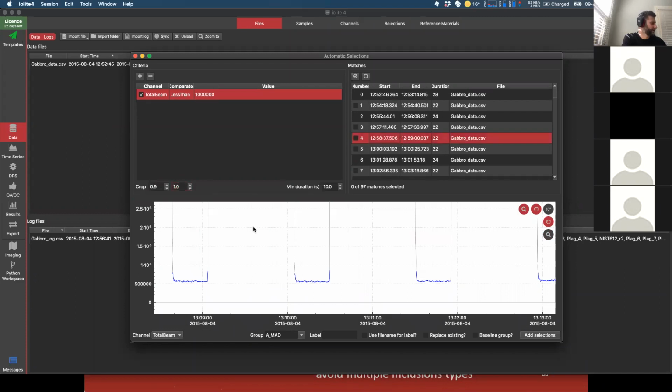And that's not doing enough of it. Let's click it up to 3 seconds. This to 3 seconds. And that's not adjusting it very quickly either. Oh, sorry, that doesn't change the matching criteria. That changes the period that would be selected.